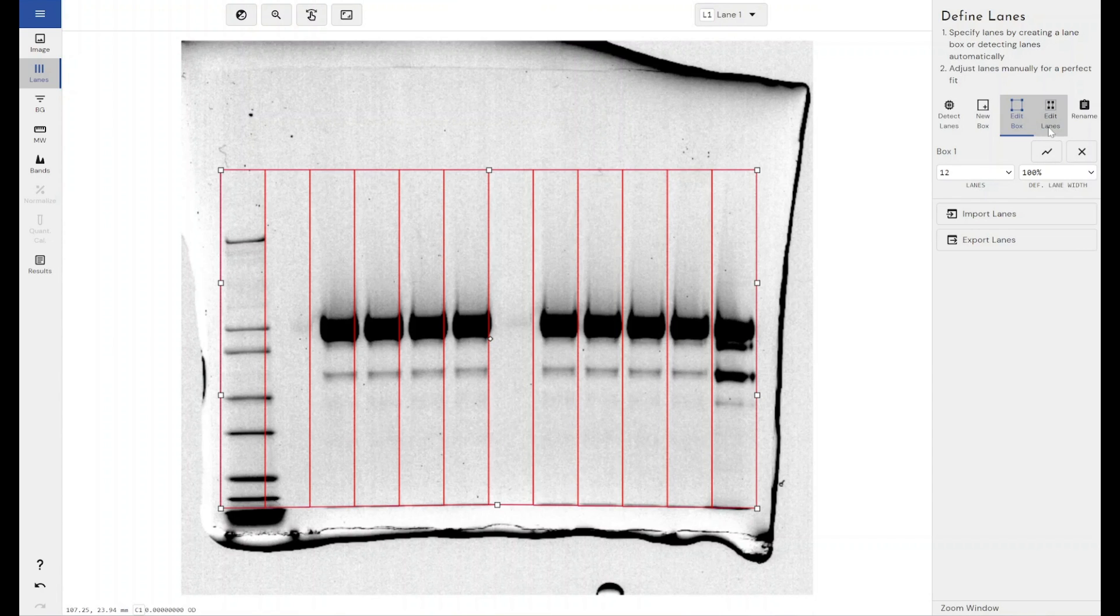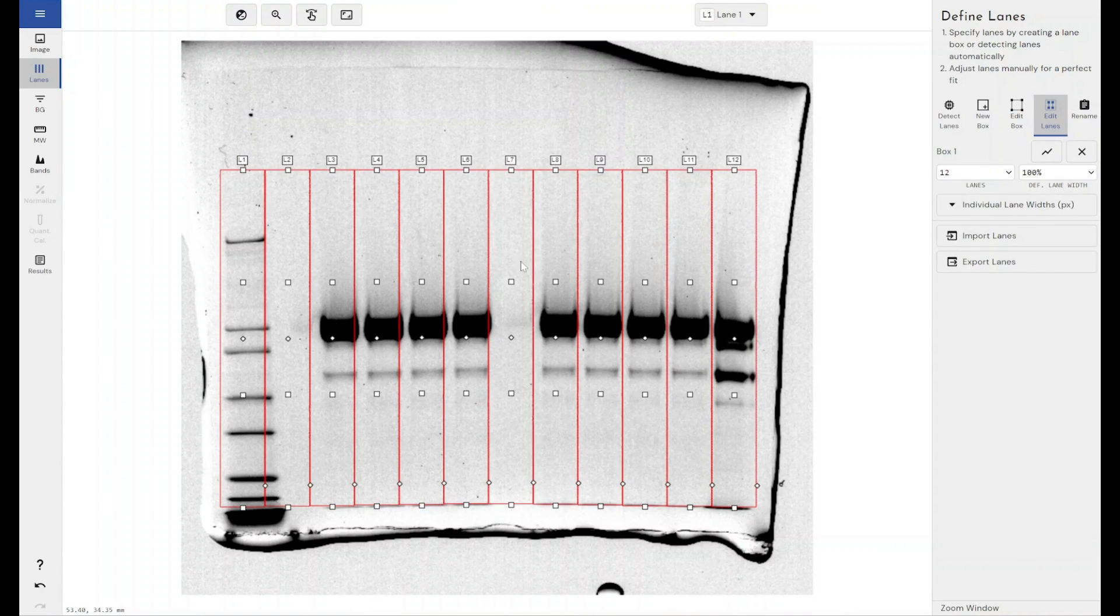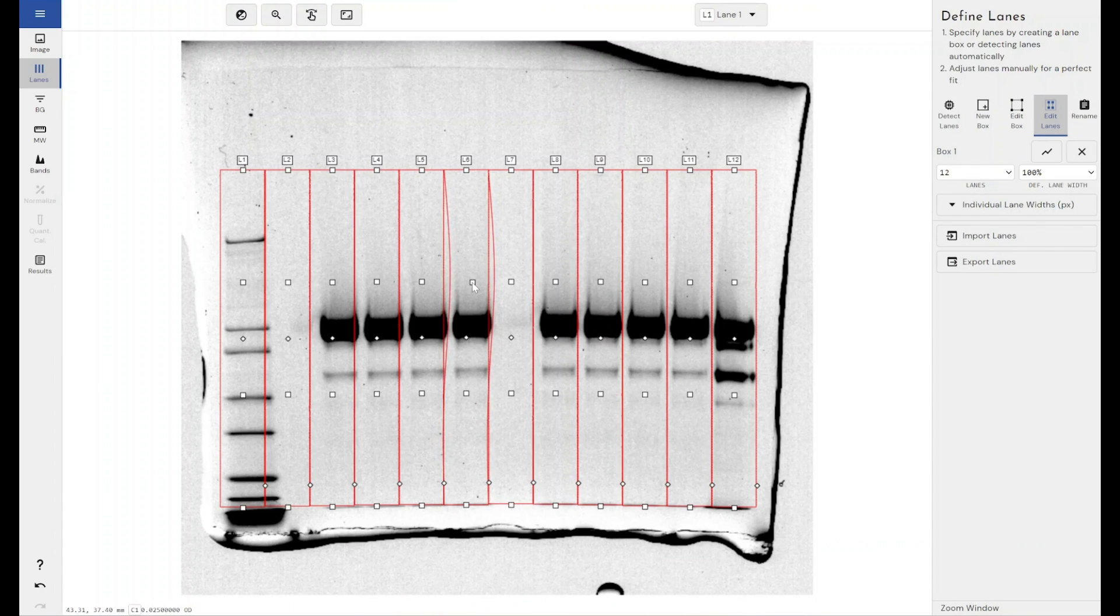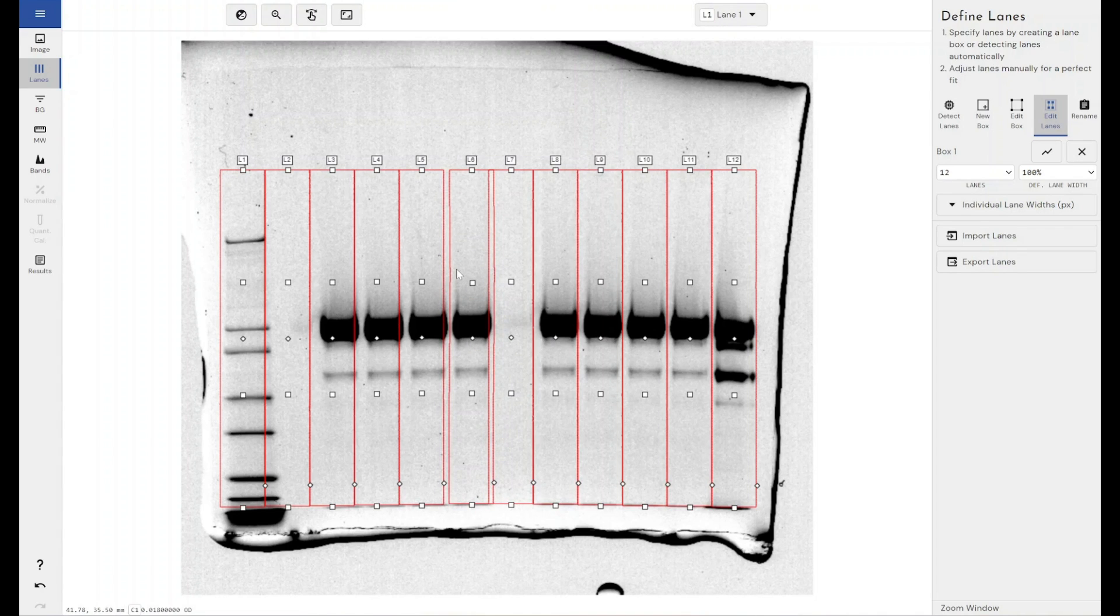And you can even go further than this. If you keep clicking subdivide you can get more handles to really bend your lane box to match how your data looks, and you can edit your lanes if you need to add any kind of horizontal warping in or move them about manually if they're not equally distributed amongst your gel.